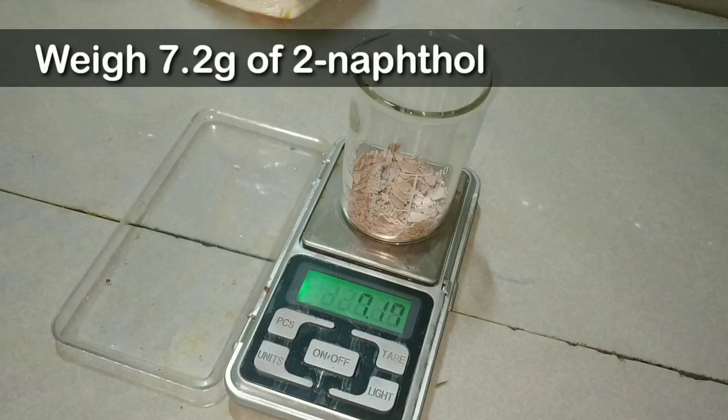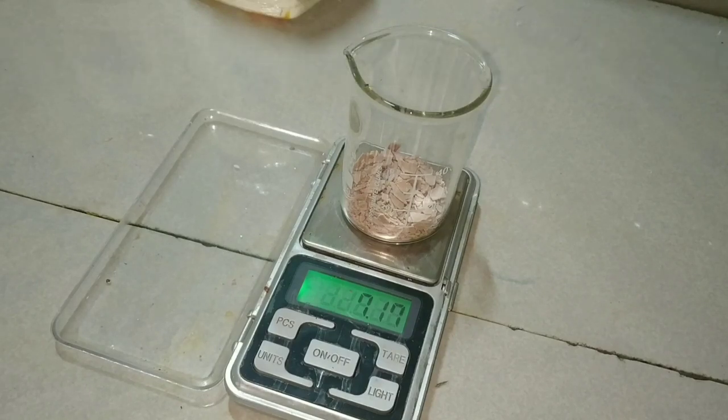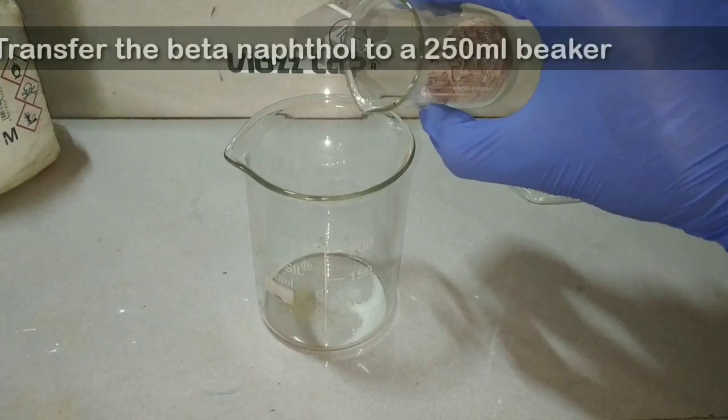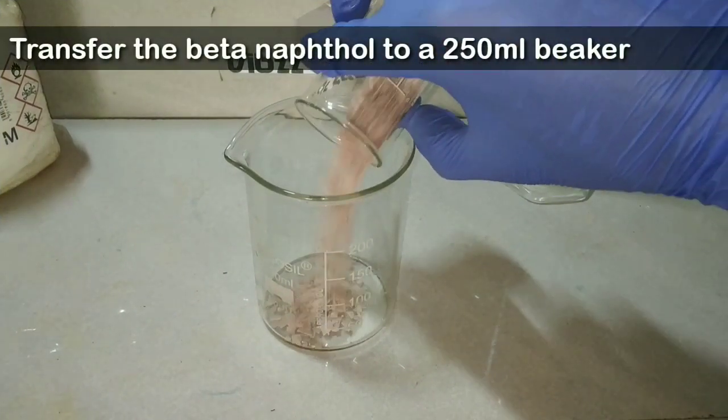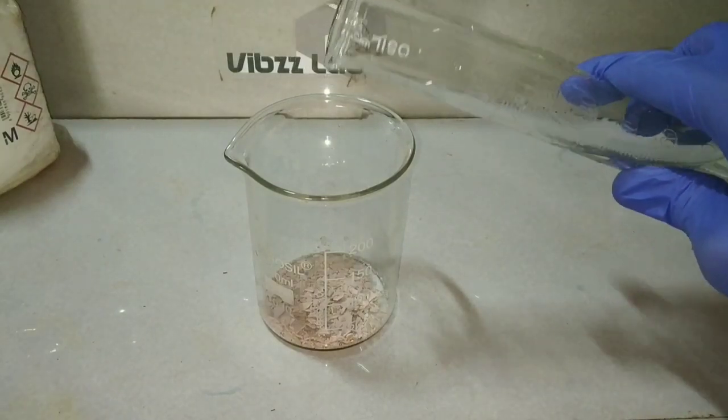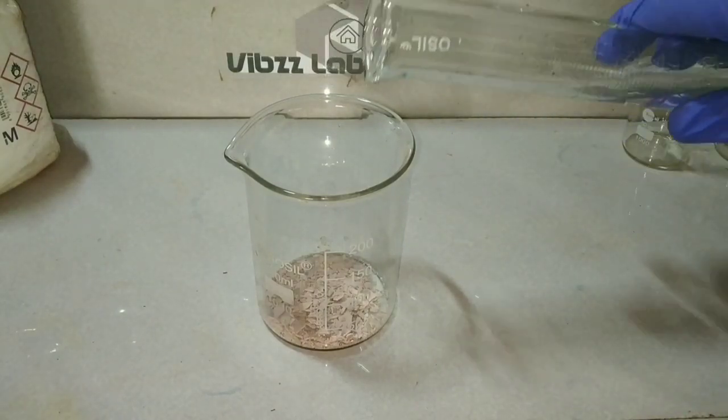We weigh around 7.2 grams of 2-naphthol, that is beta naphthol. We then transfer this beta naphthol to a 250 ml beaker and dissolve it in sodium hydroxide solution.